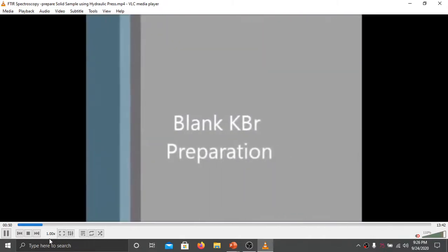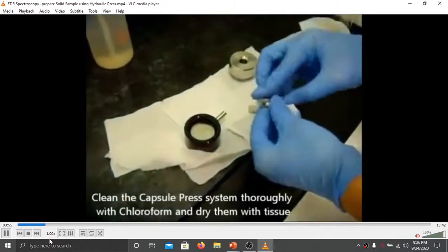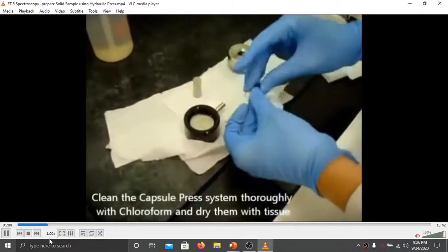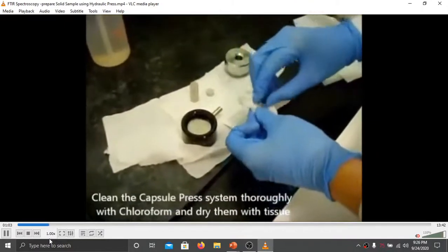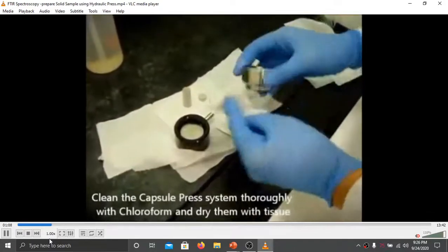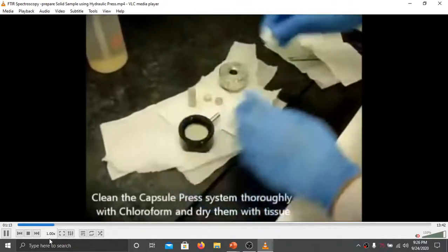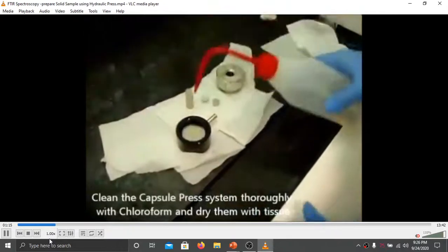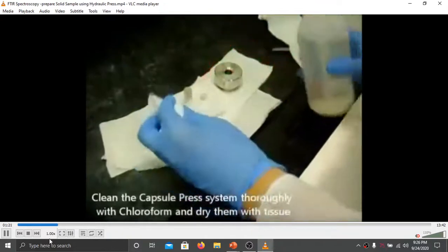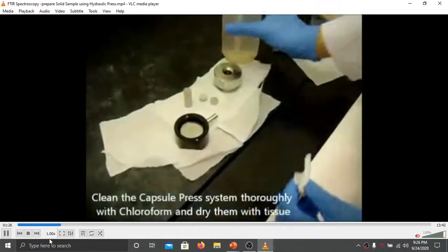The procedure includes first the formation of the blank KBr pellet. For this, thorough cleaning of all components is required so that there is no previous residue of material adhering to your die and the holders. These are all cleaned thoroughly with tissue paper first. Then this is chloroform, which is used as a solvent. It is a wash bottle not containing water but containing chloroform. All parts are cleaned thoroughly with chloroform.